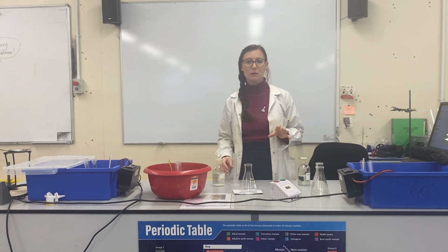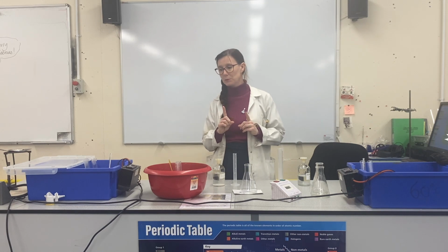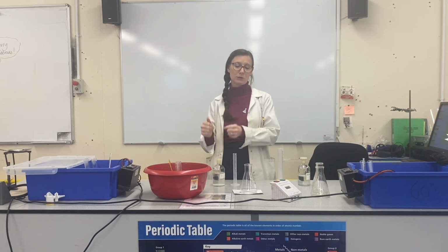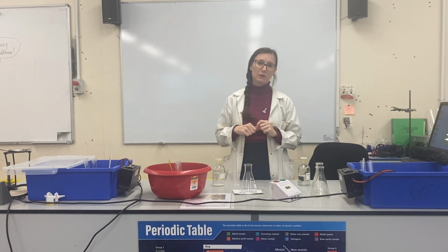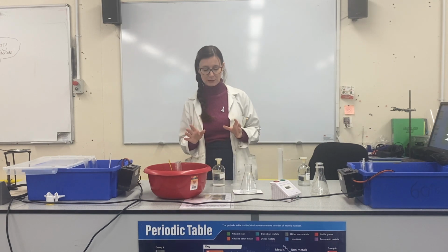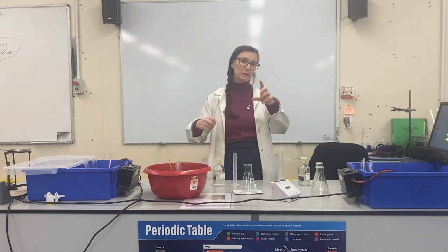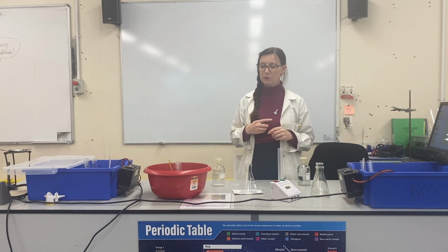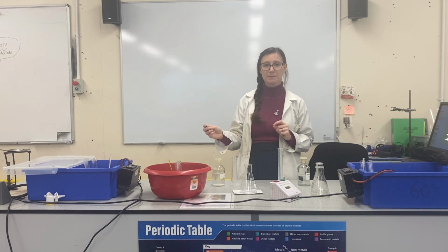When we do it in class, there are lots of you using the water bath, so you do need to make sure you label your boiling tubes so that you collect your 2 and you don't end up putting 2 boiling tubes of acid in your conical flask, because you'll be waiting a long time for a precipitate to appear. I'm going to quickly set up the rest of these and relocate the camera so that you can see the cross more clearly as we do the experiment.